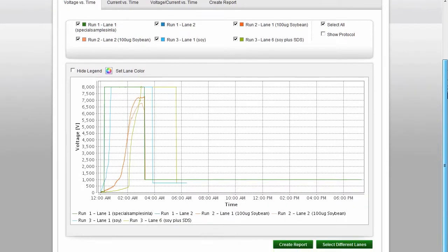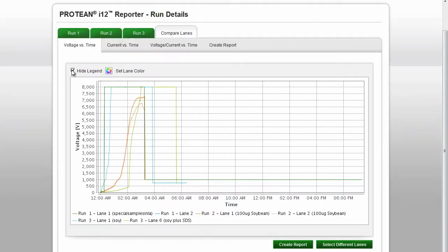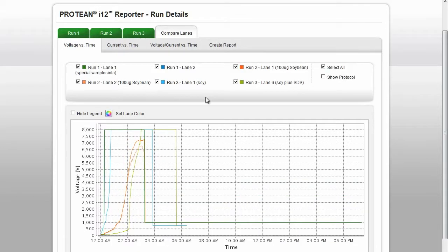You can hide the legend by clicking the Hide Legend box. At the bottom of the screen is a button to select different lanes if you choose.